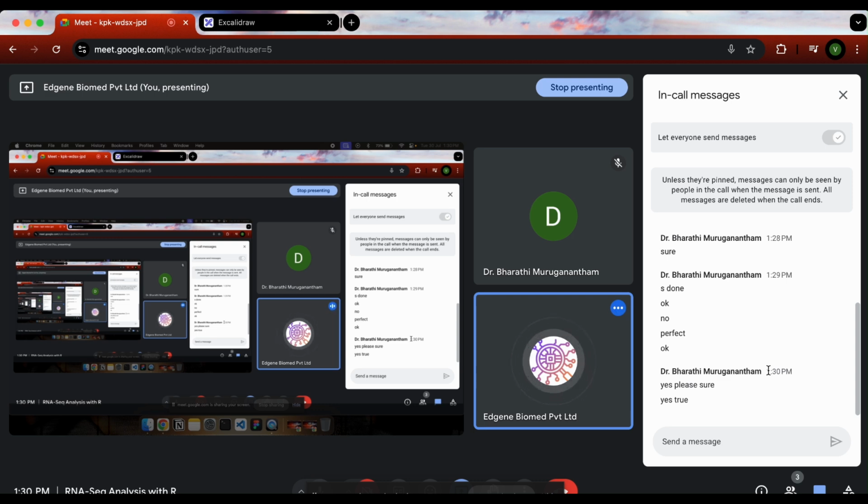I will have a presentation so that all the steps and everything are mentioned in that video. But today I really want to be pretty much sure that your Linux is responding to the commands which we are going to do.